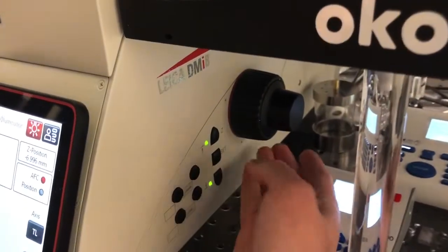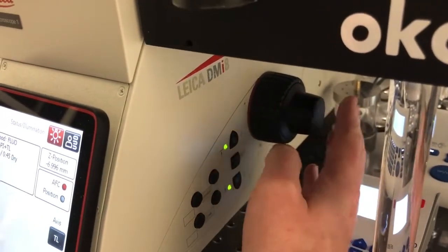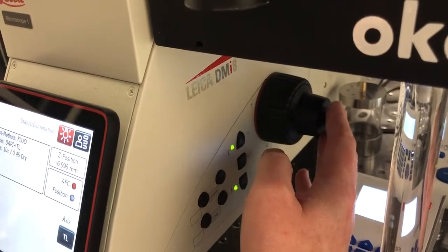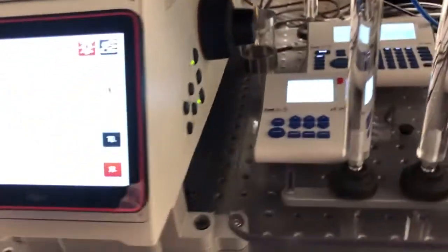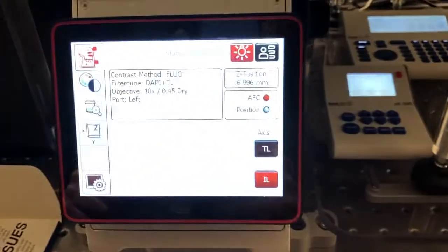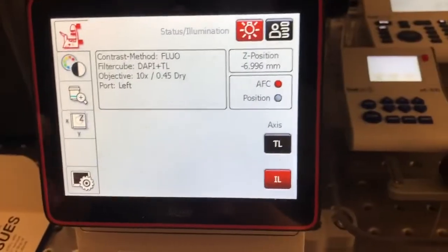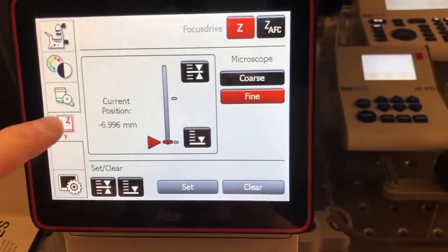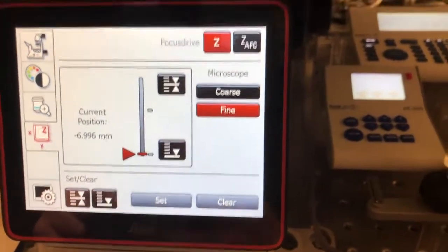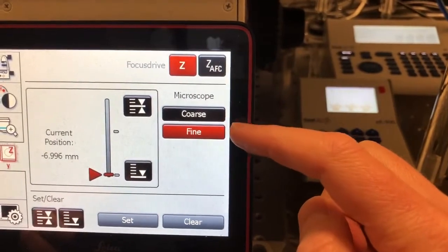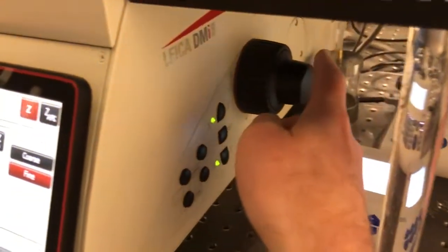There is both a coarse and a fine focus here. In addition, if you go to the touchscreen and click on this setting, there is a further coarse and fine setting which affects both of these.